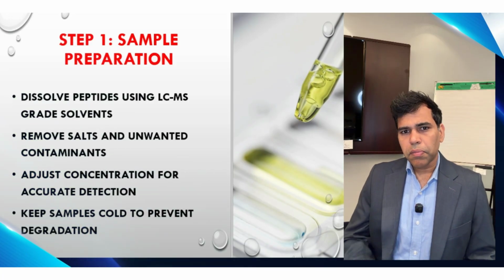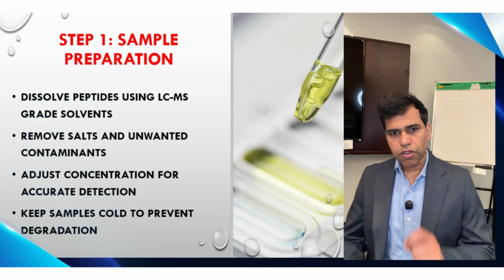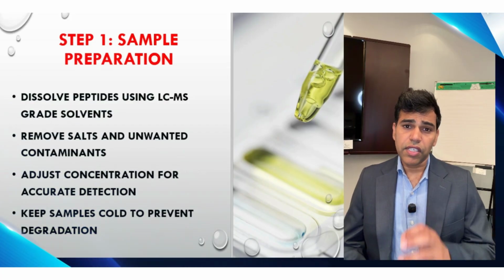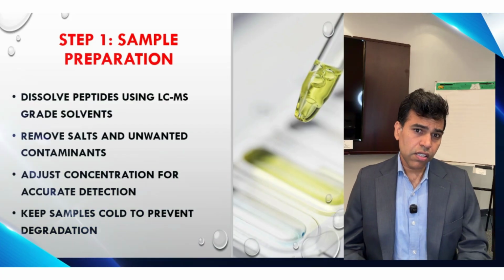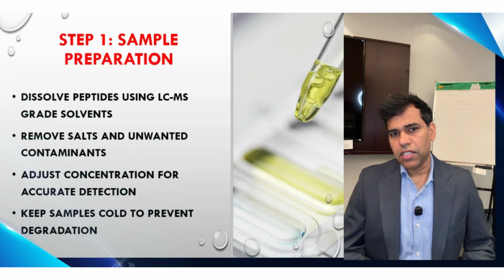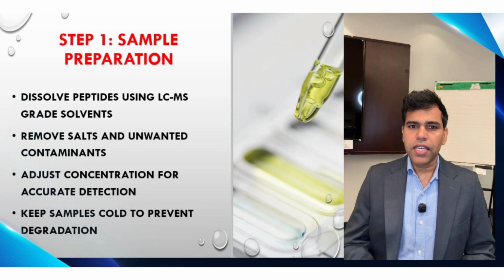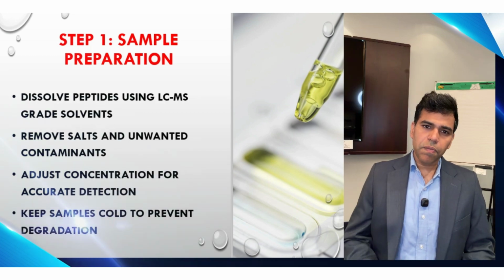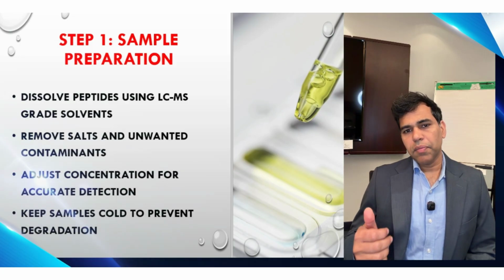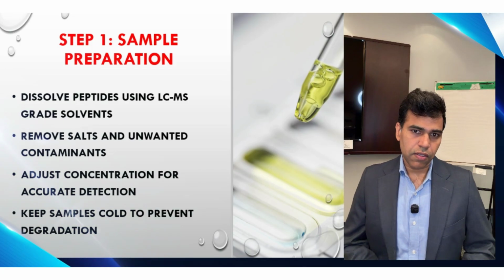But the execution demands discipline. Semaglutide is hydrophobic at its acyl chain and must be handled at concentrations that prevent aggregation without sacrificing detection sensitivity. A less experienced team might spend weeks optimizing the instrument and never look back at the preparation, and that's precisely where the signal loss begins.